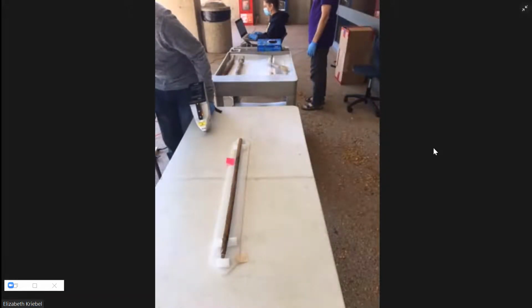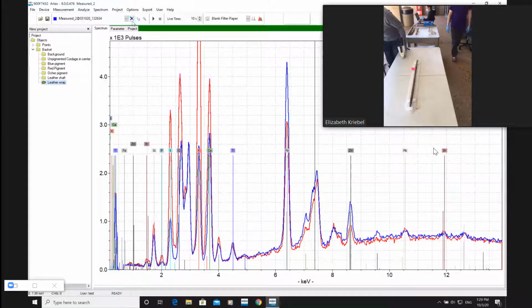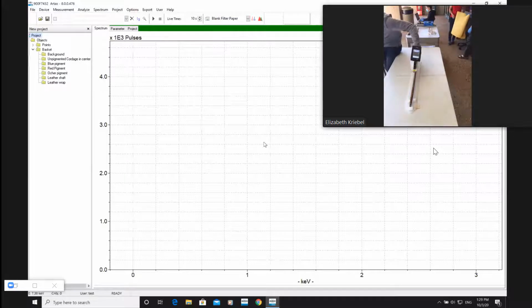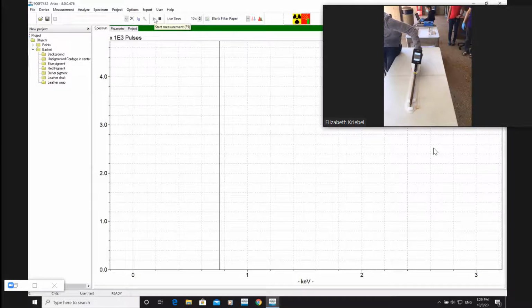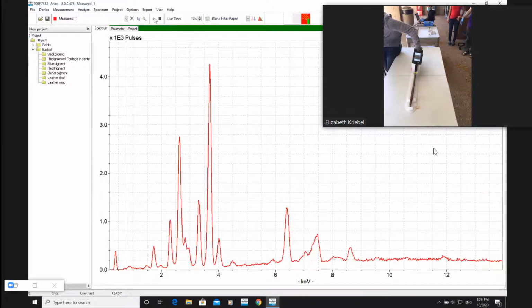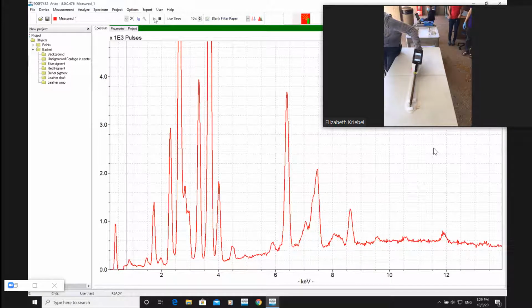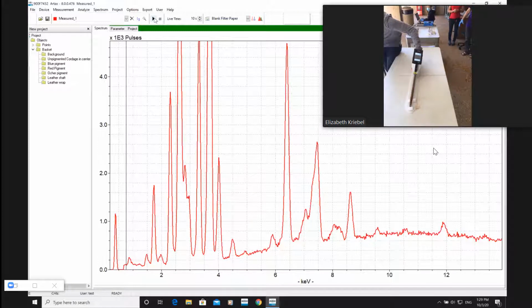We want to go back to Artax. And I've saved these two, so I'm going to clear this. And this, I think, is just going to be a spot measurement. So I'm going to get this into position. Literally these baskets are sitting down here too. The one was way different than the lab. It occurs to me as I measure this, I almost never hold this thing in my left hand. So I was going to put that card in.